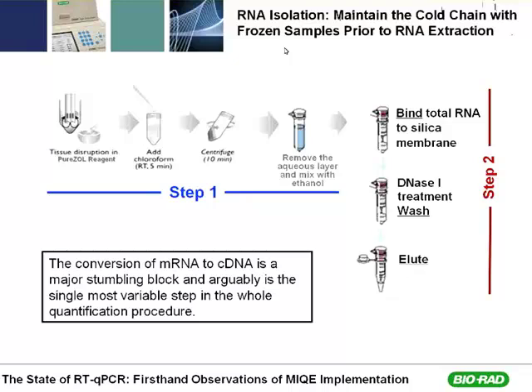I recommend fresh frozen samples. I always recommend trying to stop transcription as fast as possible when you lyse cells or extract tissue from an organism. So for tissue, I usually recommend liquid nitrogen so that the samples are flash frozen so that transcription stops immediately. But then if you're using fresh frozen tissue, it's important that the tissue remains as close to -80 as possible, so on dry ice, all through the process until you finally homogenize the tissue in the extraction buffer.